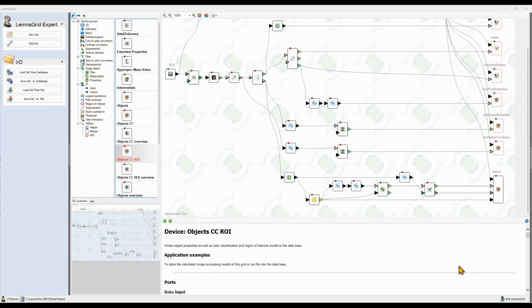Now we get to a more special analysis. We want to count how often roots cross and how often they fork. Due to technical reasons, some crossing roots may turn out as two joints close to each other in the skeleton. However, sometimes there are really only two joints that happen to be close by. Therefore, there's some ambiguity and we have to define a threshold somehow. But let me show how that is done.